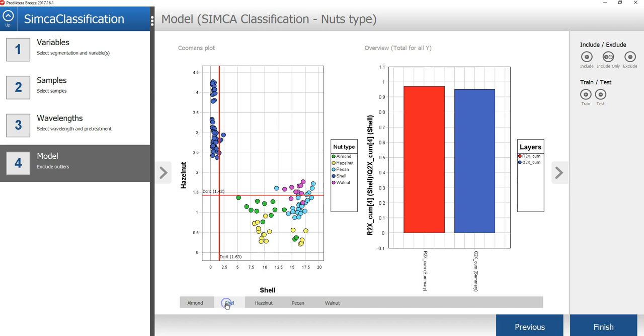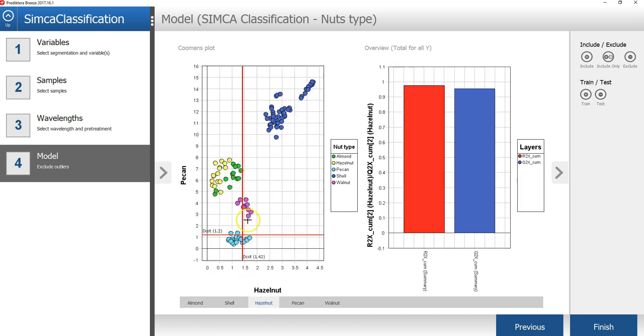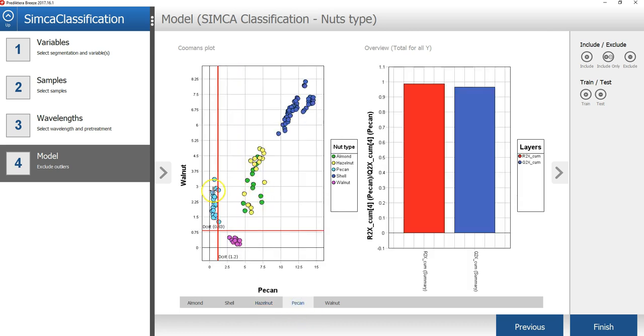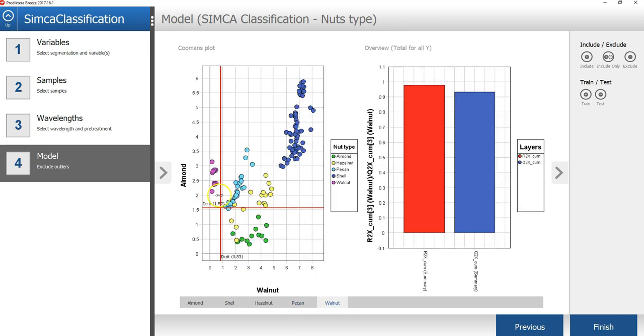By clicking on the tabs underneath the plot, I can adjust the limit for each class model. Once I have set all the critical distances for all the models, I can click finish.